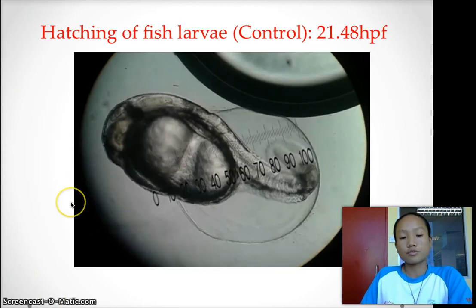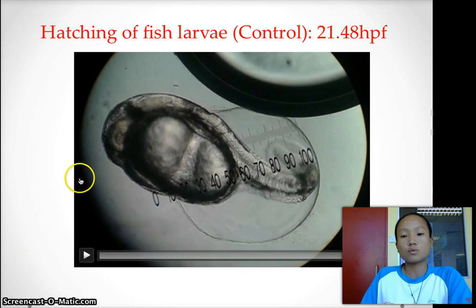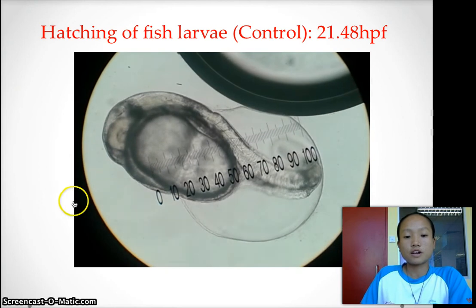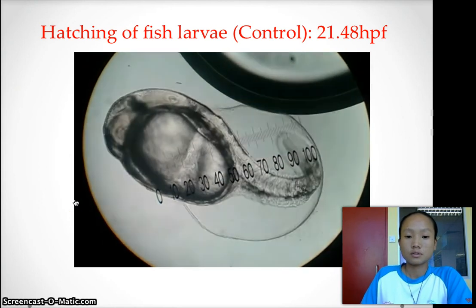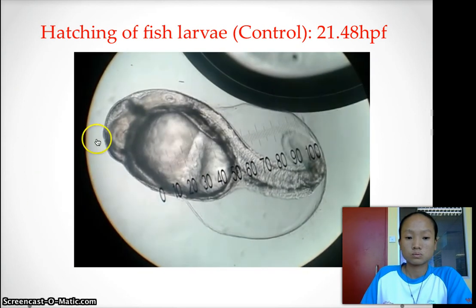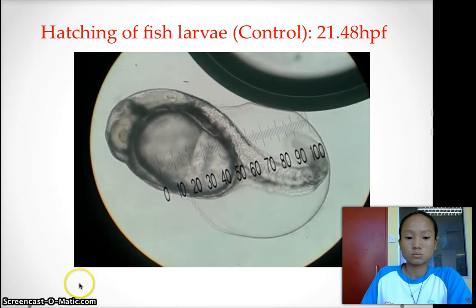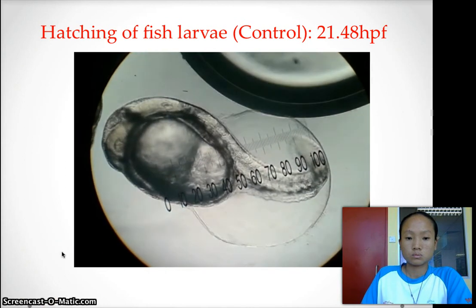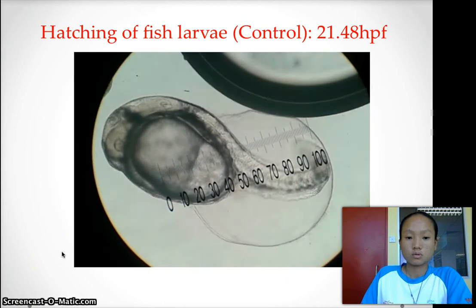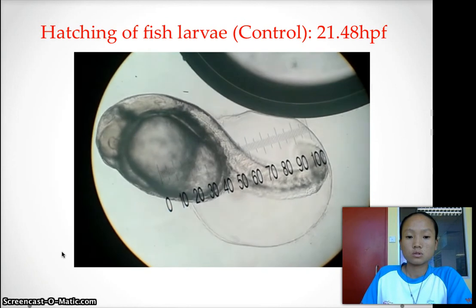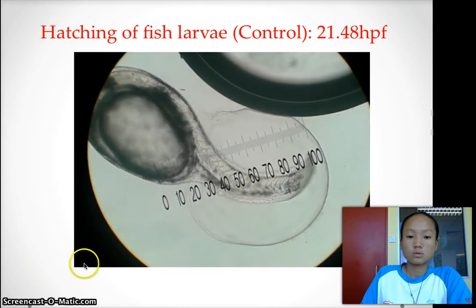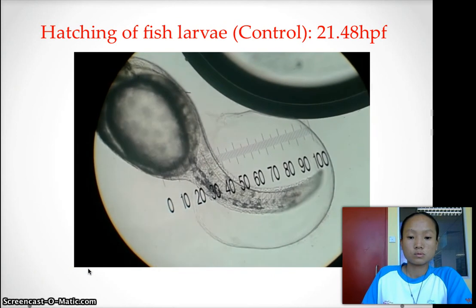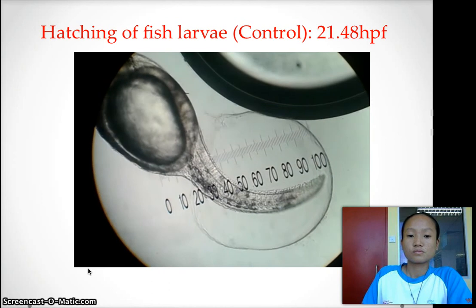Here we show a video of hatching of the fish larvae in the control group at 21.48 HPF. This is the hatching video in which the fish larvae hatched halfway.